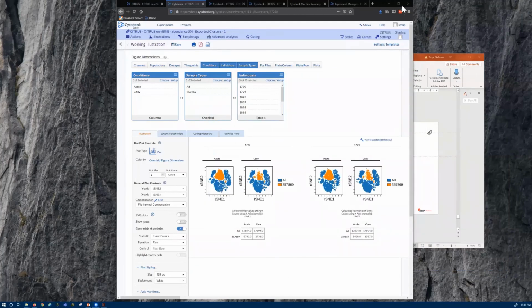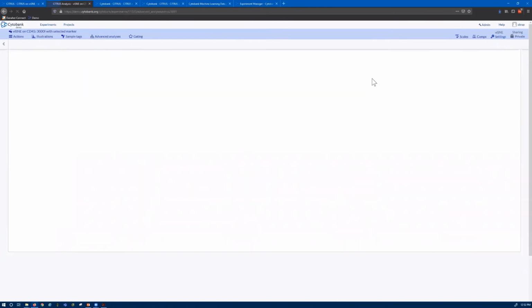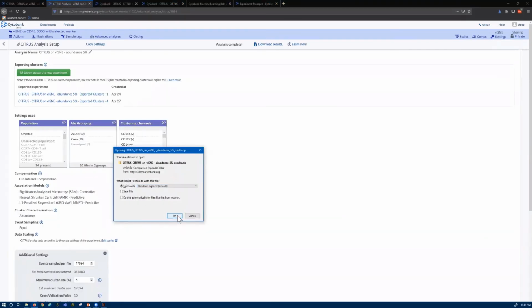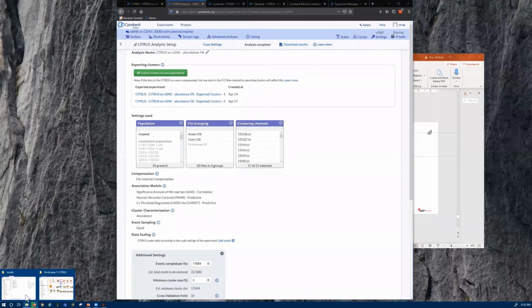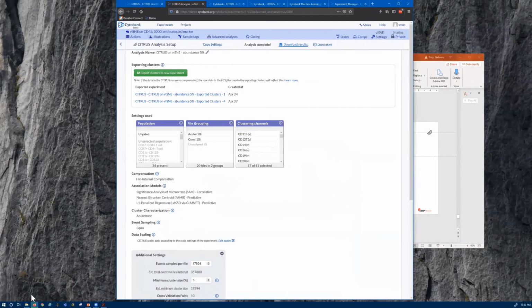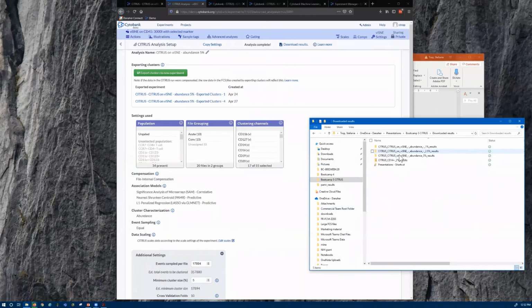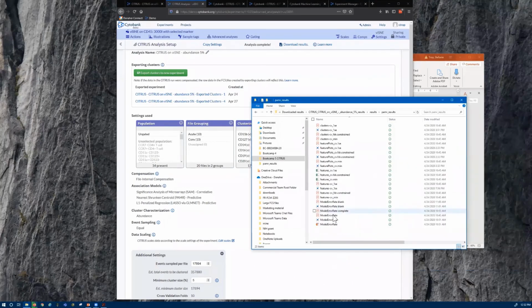Yes, this is a great question. Thanks, Alina. The first thing I suggest is that you look at the cross validation error rate of the LASSO model you get, and whether that error rate is really high or acceptable. It is possible that you can get a model, but the model has a very high error rate, and for those kinds of models, it would not be very surprising to see some biomarker clusters that are not visually different.